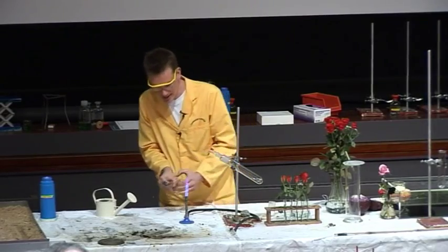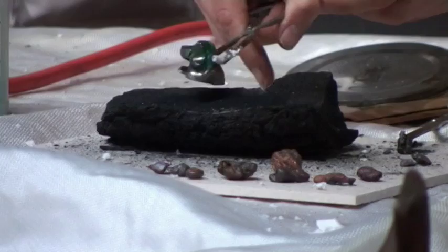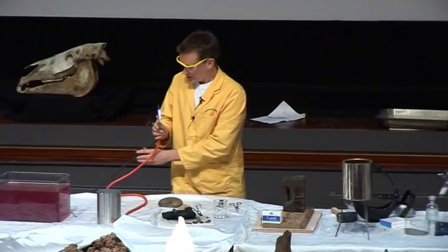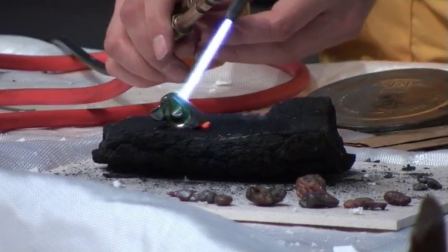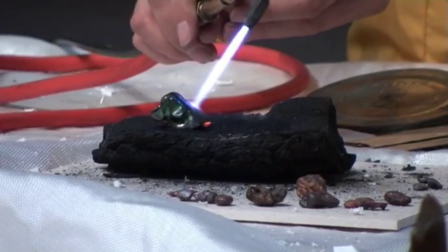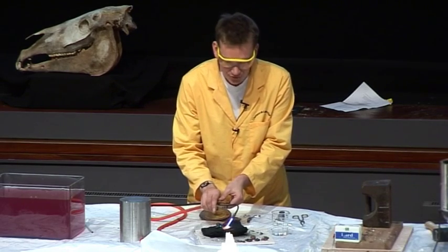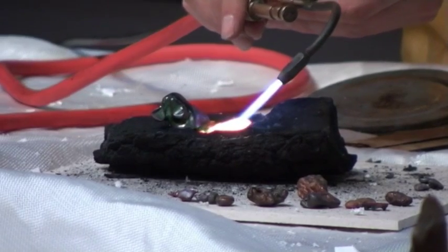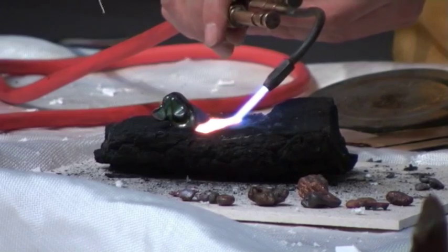I'm going to heat him up a little bit more strongly over here on a piece of charcoal. Remember, the charcoal is impure carbon. So let's just heat him up strongly — he's decomposing and forming copper oxide. So he's certainly very black now. But the copper oxide is going to begin to react with the carbon in the charcoal, and the carbon steals away the oxygen from the copper oxide, forming carbon dioxide, leaving behind the copper.